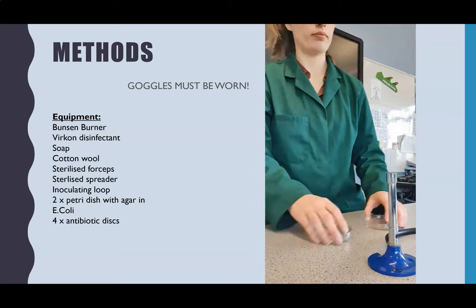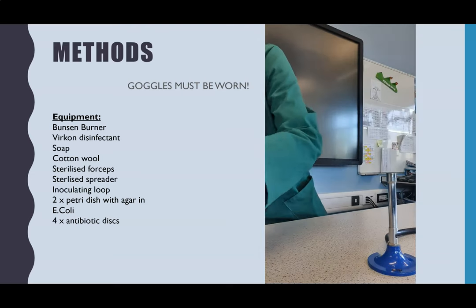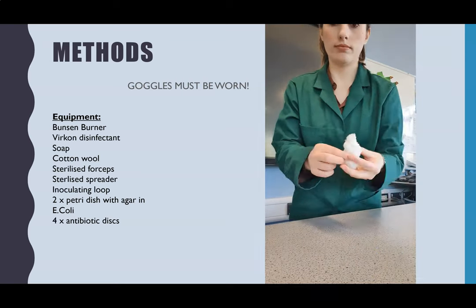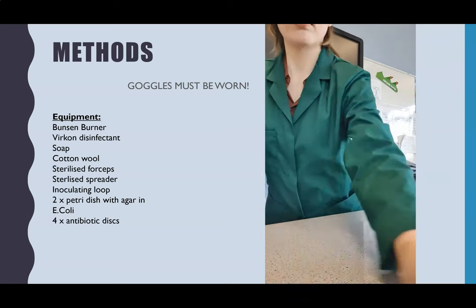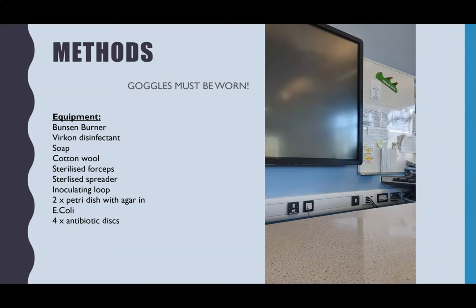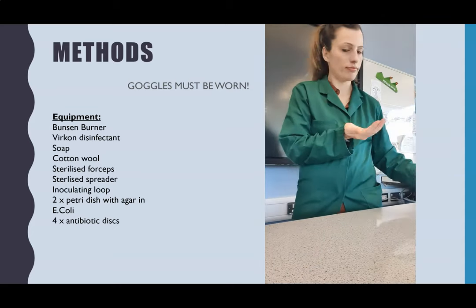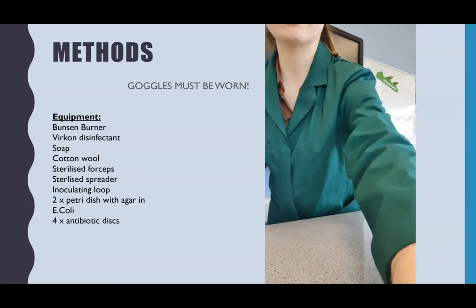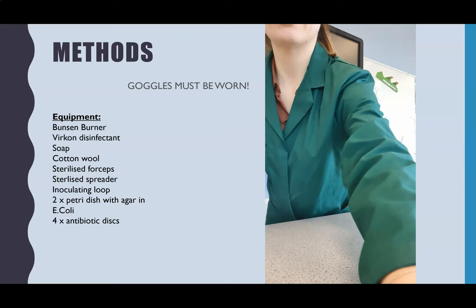The final thing is post-inoculation sterilisation. I need to disinfect the whole workspace again, put everything in the bin, and then use soap — actually that was hand sanitiser — to clean my hands. That is the full method. As I pointed out, you should have goggles on the whole time, and the syringe is not on the equipment list.